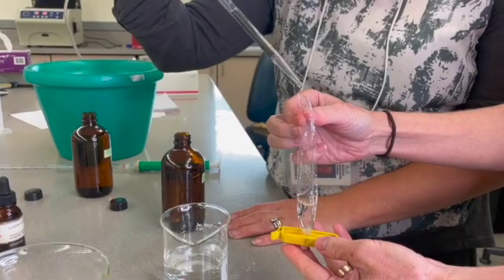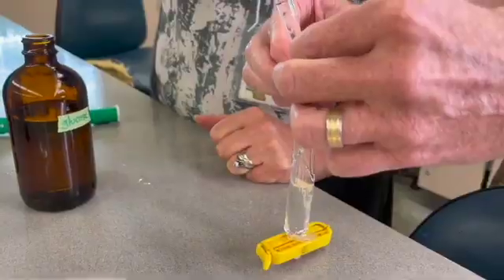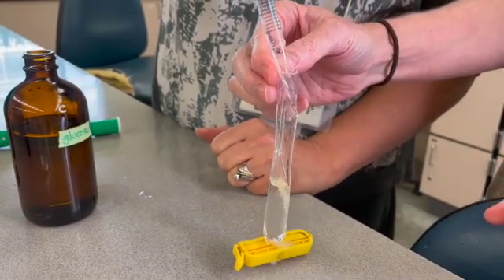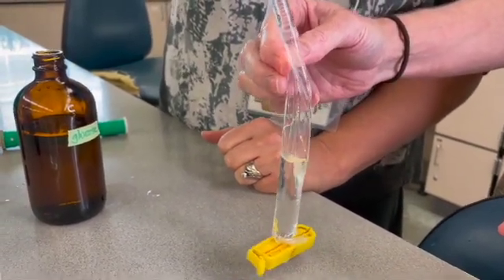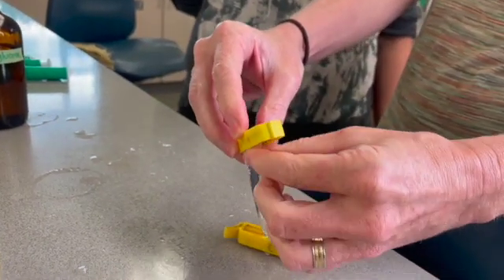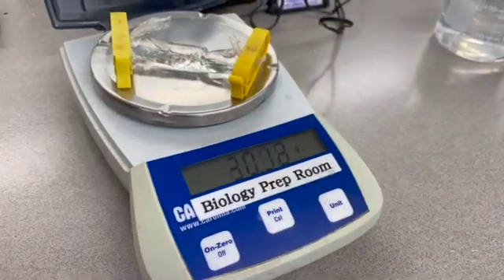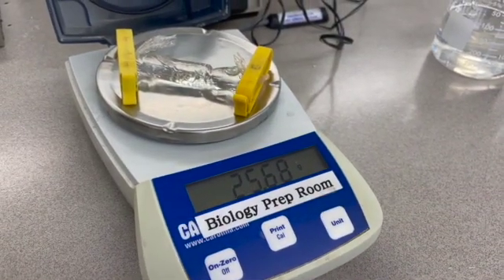Next, we measure some glucose solution and add it to the same piece of dialysis tubing. Once both of these solutions have been added, we clip or tie the dialysis bag at the top. After ensuring that it doesn't leak, we weigh the dialysis tubing.